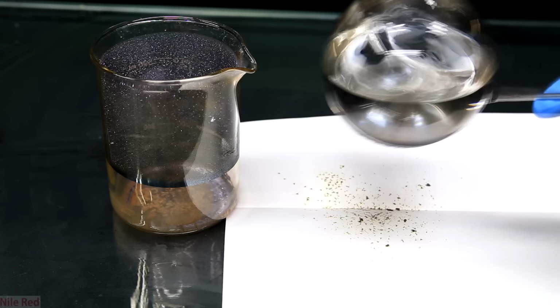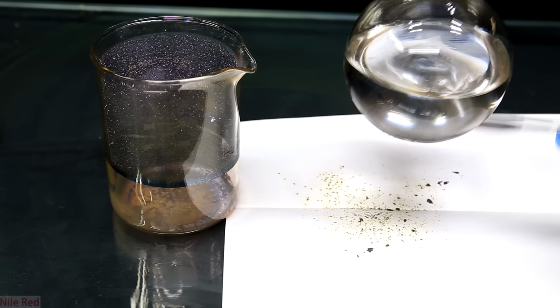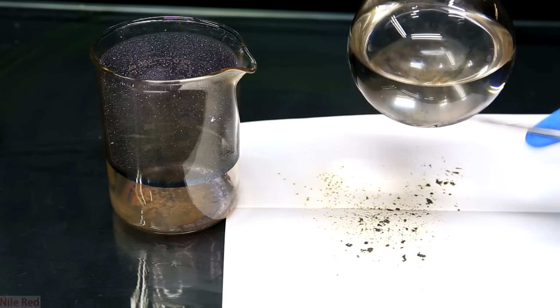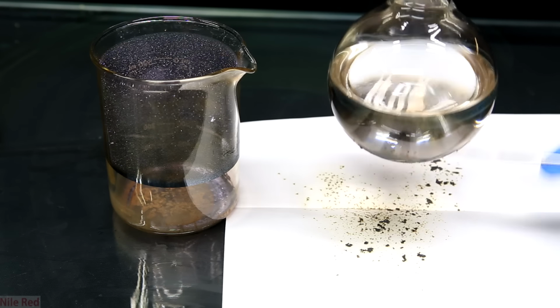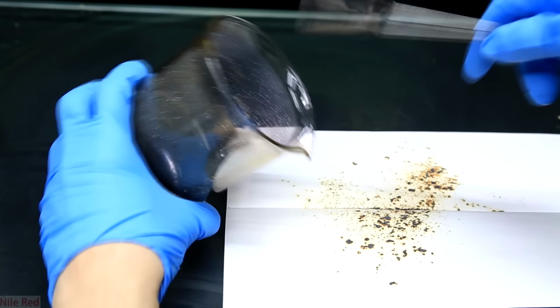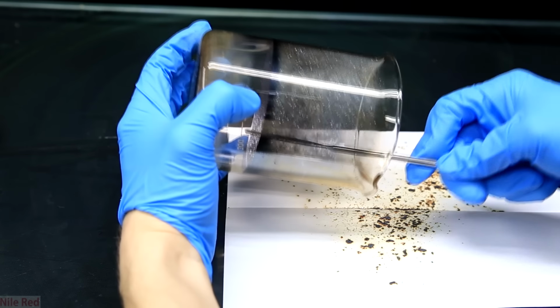Whenever I carry out these quote-unquote sublimations, I never get any crystals settling on the bottom of the flask. For me, it always settles on the side of the beaker, but if you were to carry this out, you might get a lot of crystals on the bottom of your flask and not so many in the beaker. Anyway, once the flask is clean, we can move on to scraping the crystals out of the beaker.